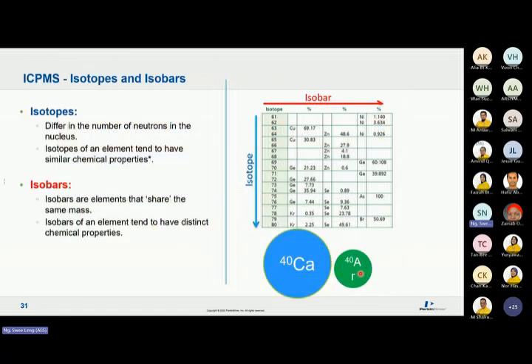Right. So in MS, you got three types of problem. Because in MS you are running isotopes. So for example, let me give you some idea first. When you run copper, you got two isotopes, 63 and 65. And then isobaric means, let's say you look at zinc, it actually has about five isotopes. This is the most abundant zinc. But in terms of isobaric, zinc has 64, nickel is also 64. This is called the isobaric interferences.